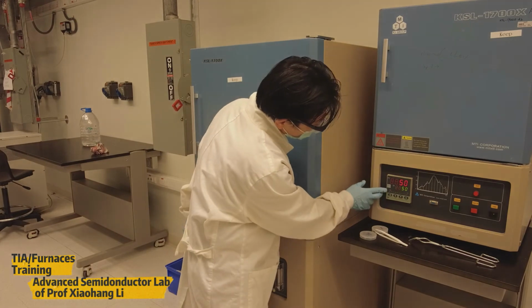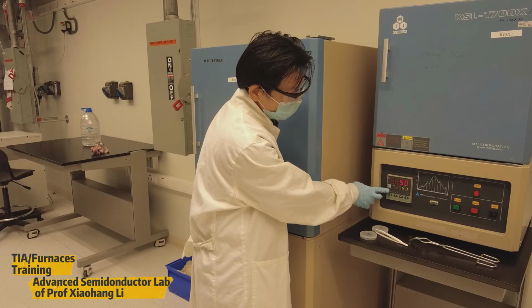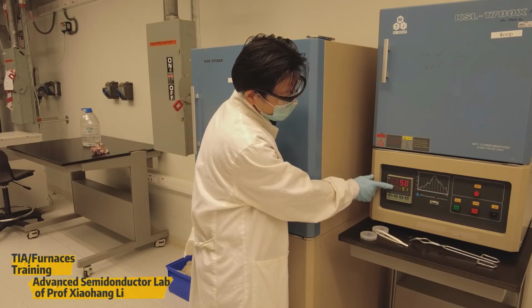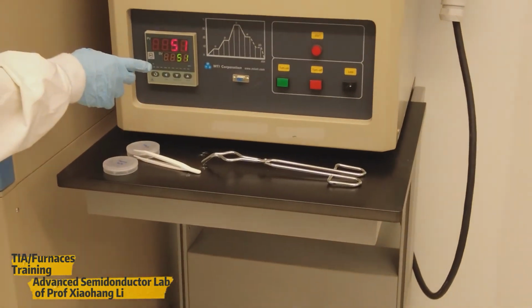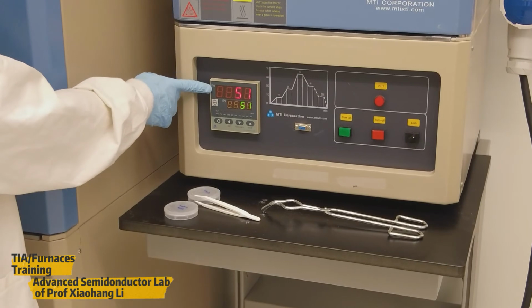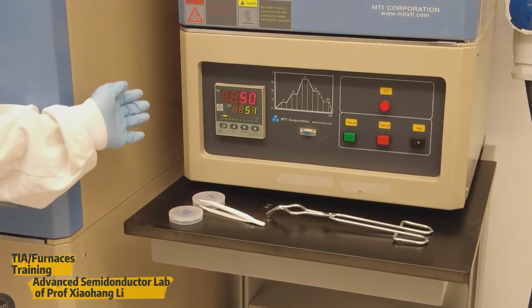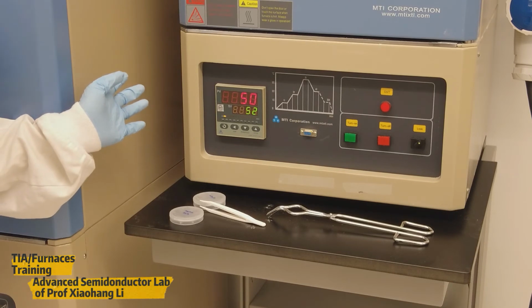Now, when you see the orange line start to indicate the power output, it means the heater started to work. As you can see, the set temperature will start to increase as in the program we set, and the present value, PV, will start to follow the SV set value.